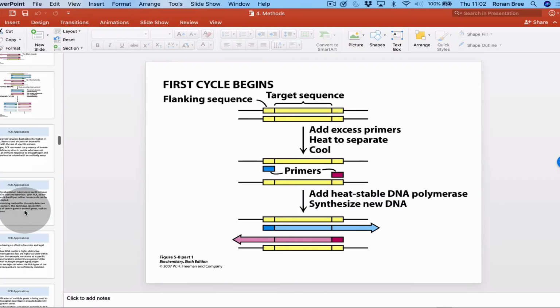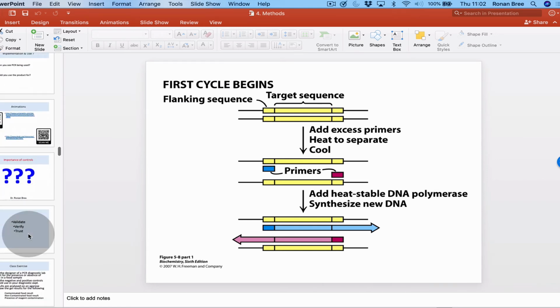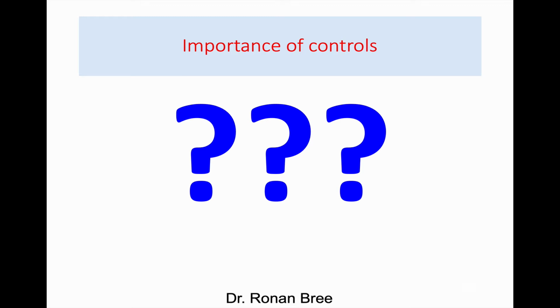Common to PCR in general, I want to get you to start thinking about controls. The reason is I think they're vital. You cannot trust any data or any experiment unless there's an associated control. I have often heard, you're only as good as your controls in an experiment. So what does a control do?